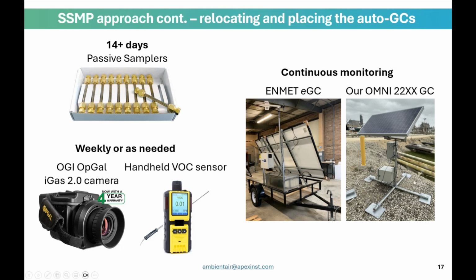Of course, they're using the passive sampler tubes that are super reliable and generate highly accurate data from the laboratory analysis, but they have no or very poor time resolution, and they're functionally consumables. Then as needed, imaging or sensing devices provide a more portable option for them, and they're flexible to use, but the data accuracy doesn't necessarily match an analytical instrument.